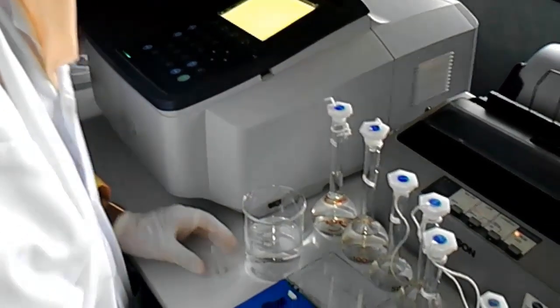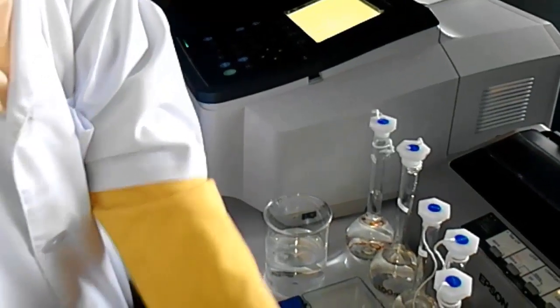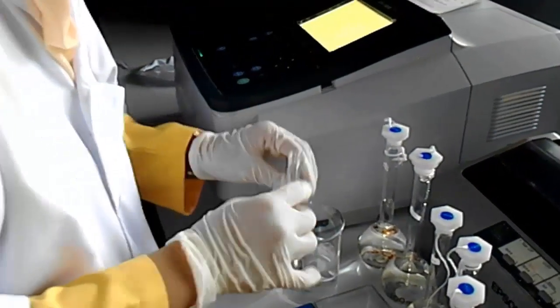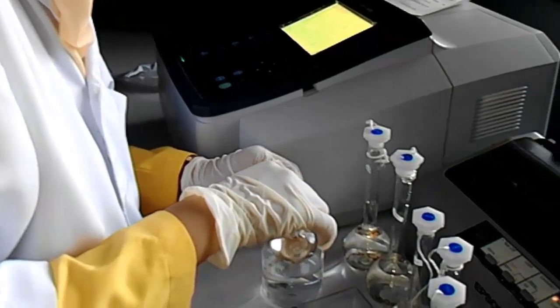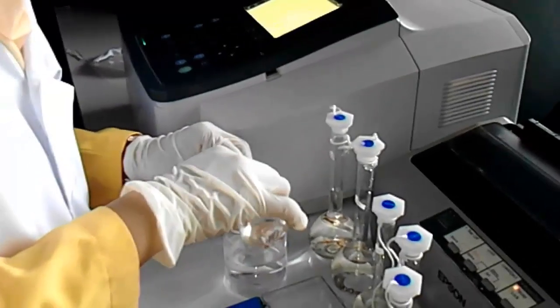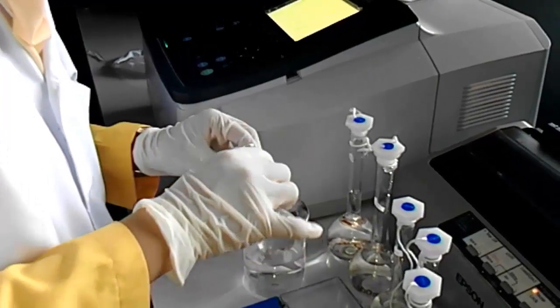And this is the 24 ppm standard of chloramphenicol. Wash off the cuvette with 24 ppm standard of chloramphenicol. Then pour it into the cuvette.